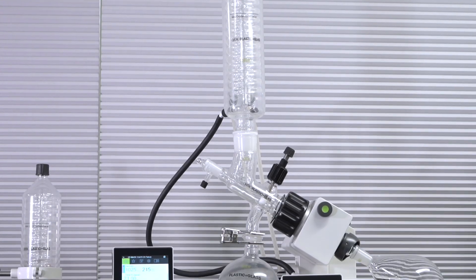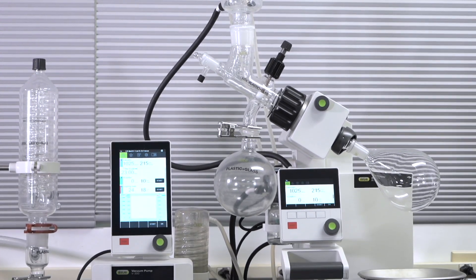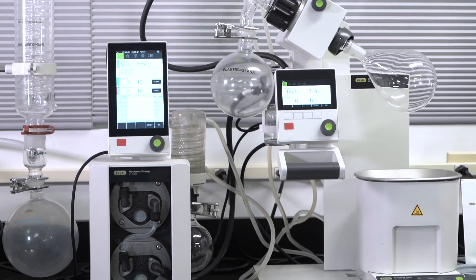Buki commercialized the rotary evaporator, or rotovapor, in 1957. The rotovap has since gained popularity as a laboratory staple for distilling solvents, typically to concentrate samples.